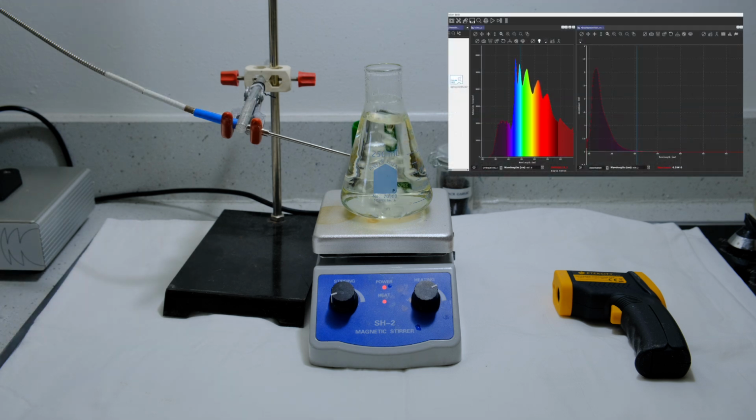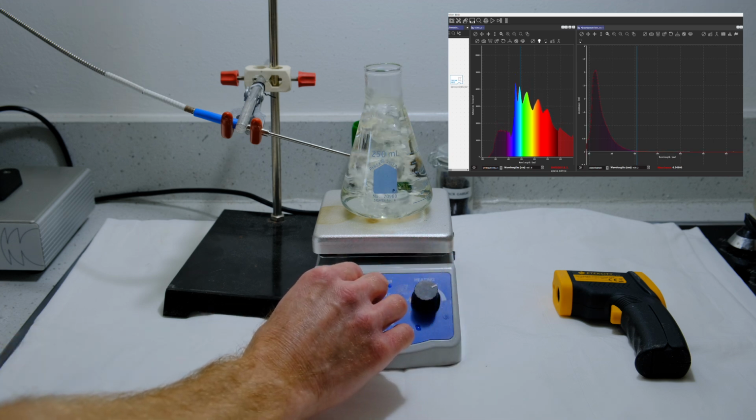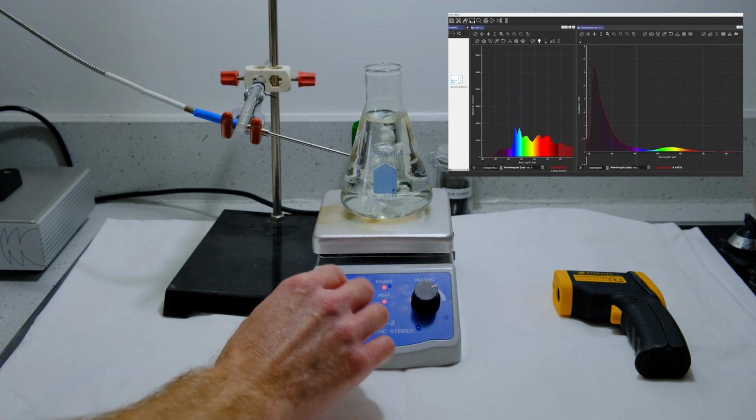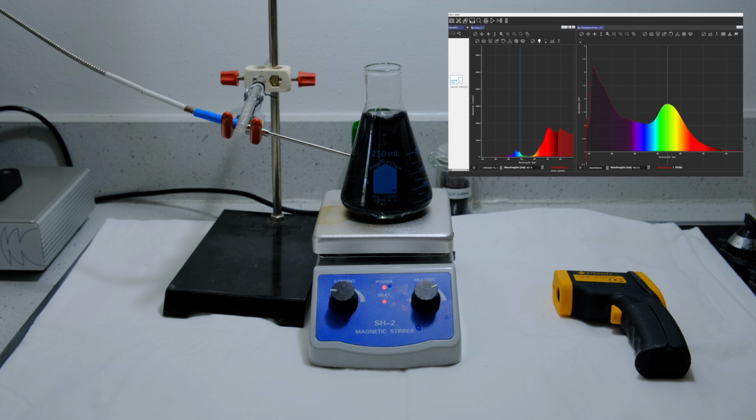We get this color change very quickly. It starts to go clear from that yellow. And everything gets darker, and there's our nanoparticles. Very beautiful. So we'll let this go for a bit.